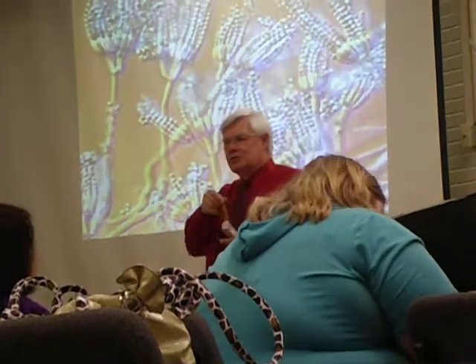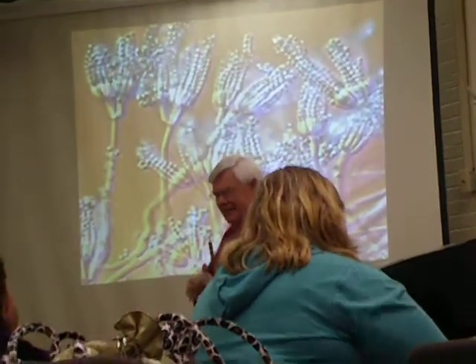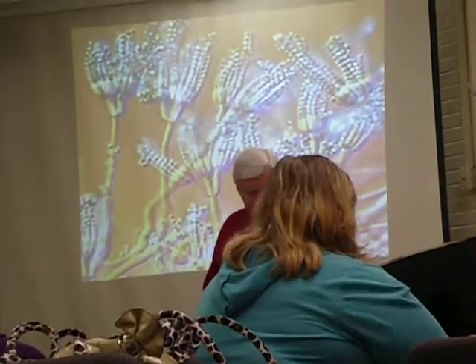Species. You had two guesses, Brad, and you got the wrong one. It looks more like penicillium, because Aspergillus was like a round ball. I got it on Friday. I know it. One thing about it, man, you are consistent.